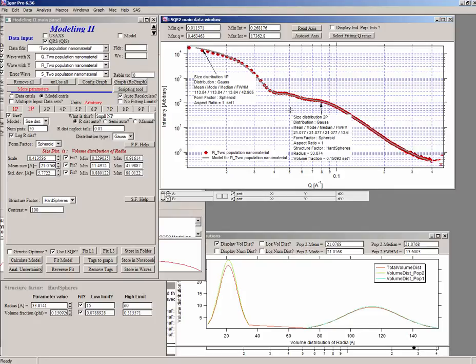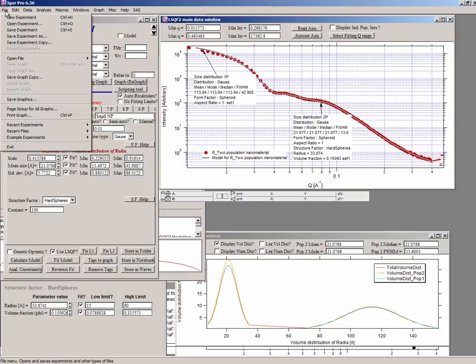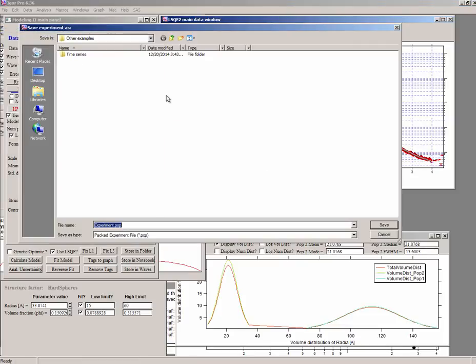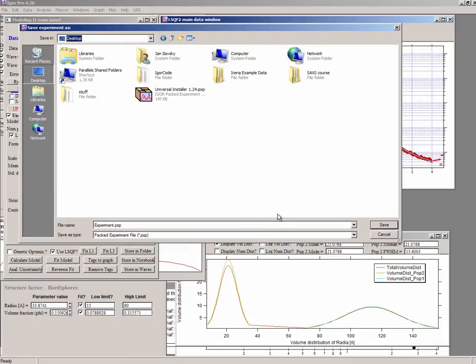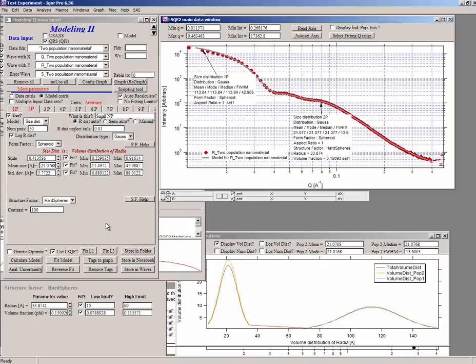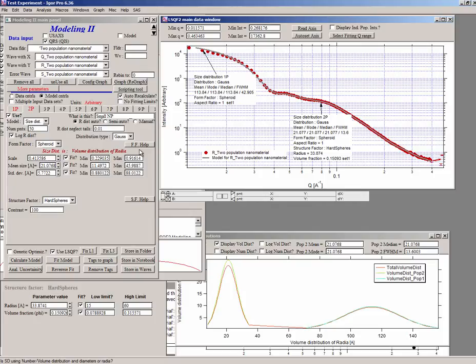Now, the last thing which you always want to do is, unless you want to lose all your data you want to go in, save the Igor experiment, you want to pick a place for your Igor experiment, and then give it the name. Then when you save that, all of this information, all of this data, everything is inside the Igor experiment, you can always come back to it, otherwise you do not have any real output. And just make sure you save the Igor experiment before you have done it.